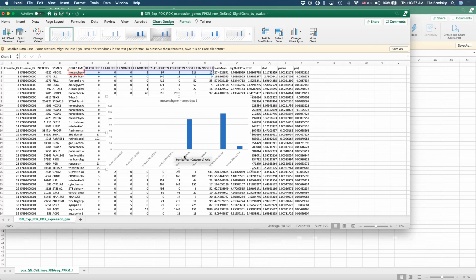This is at 0. Expressed in triple negative, but in 2 it's expressed high, and in 2 it's expressed not so high. Overall, it has a good statistical p-value, just because we only have 4 samples each, so yes, it's likely to be upregulated in the triple negative.